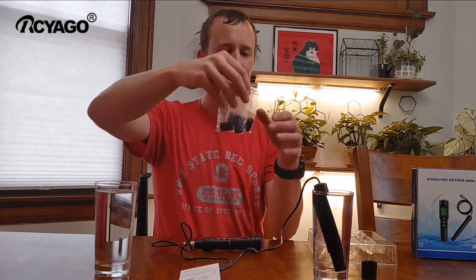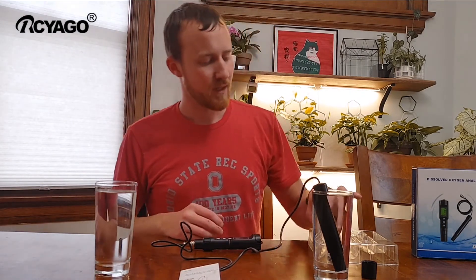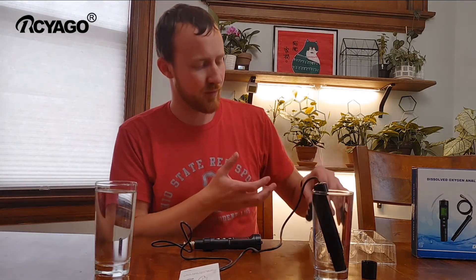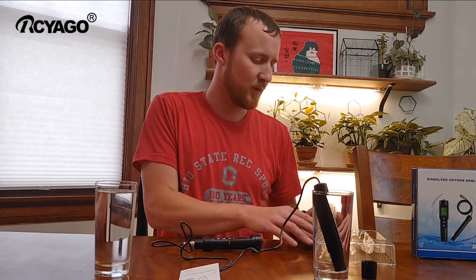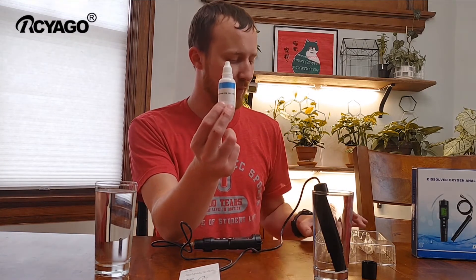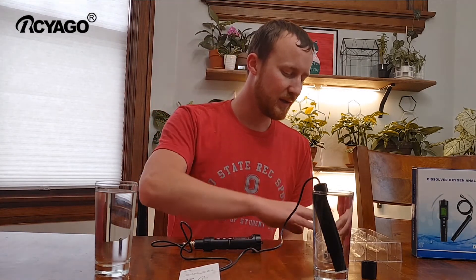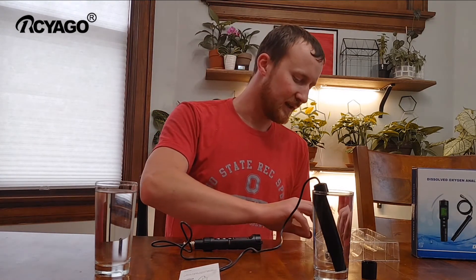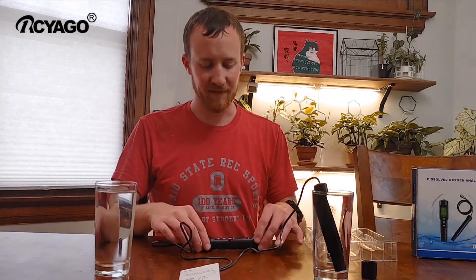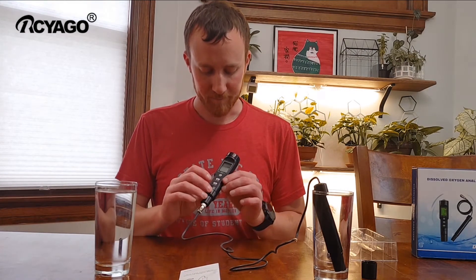These aren't single-use items — according to the instructions they are usable multiple times. The oxygen will go through the membrane into the solution. It also includes an electrolyte solution; I would guess you can order more of these. It does say DO9100 electrolyte solution on it, so I assume it's specific to this pen — make sure to order the right one.